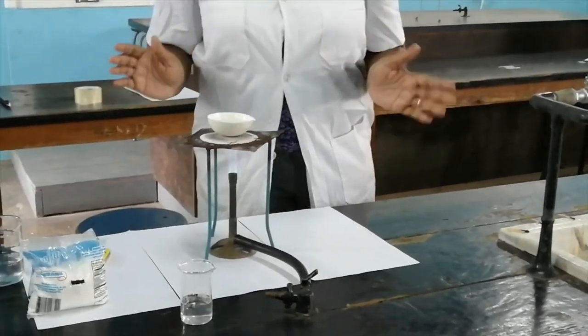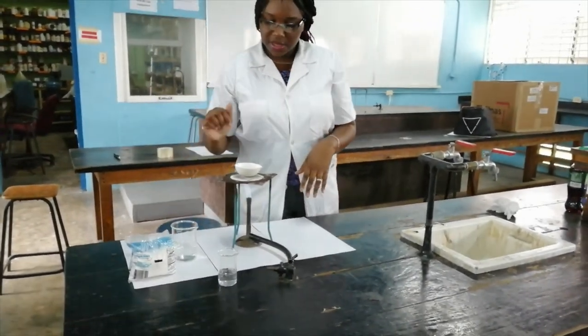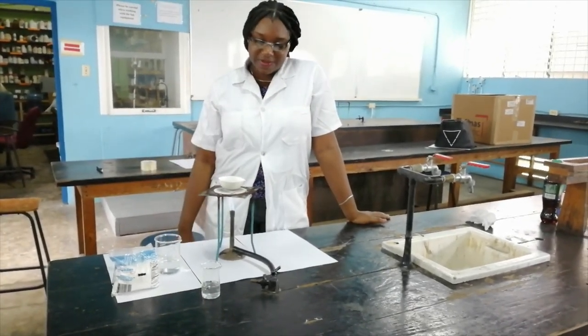This will take quite a while for all this solvent — which is the tap water we used — to evaporate and leave the salt behind. So we're just going to take a short break and then when it's almost finished we'll continue recording.